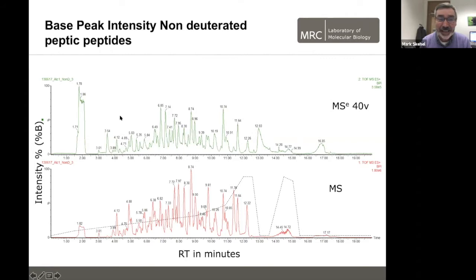And so, to identify the peptides in the first place, we take the non-deuterated form and do this MSE identification. So if you came to the proteomics talk last week, this isn't a data dependent, DDA, analysis, okay? It's a little bit like a data independent analysis; in fact, it was one of the first methods.